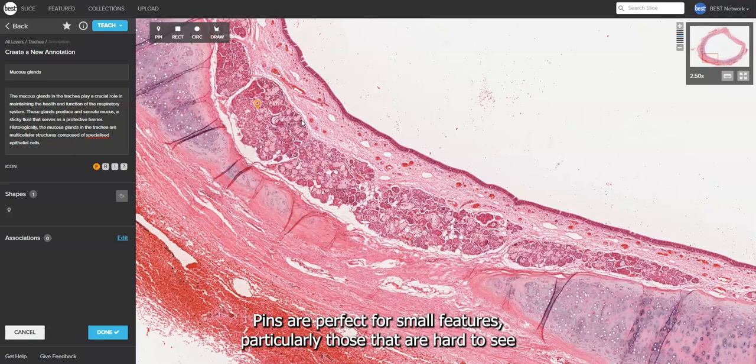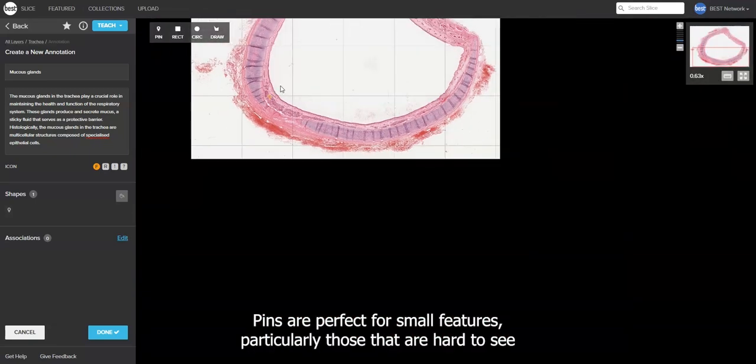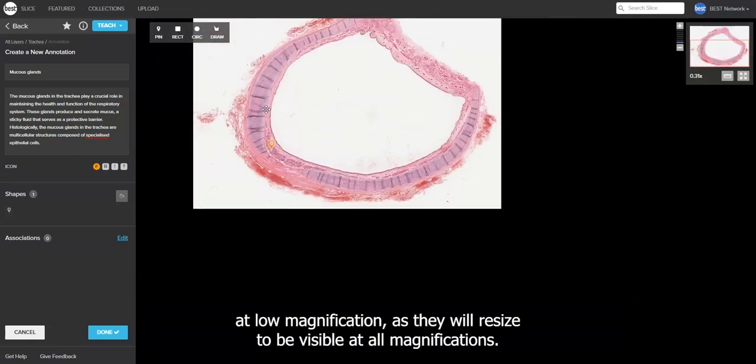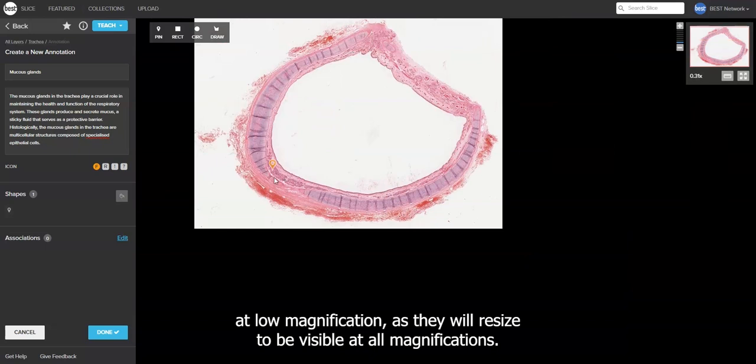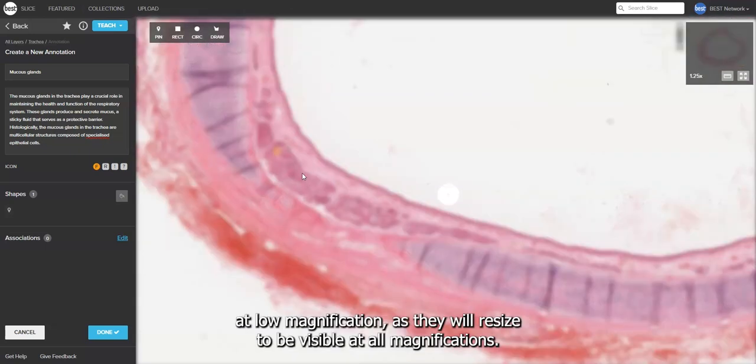Pins are perfect for small features, particularly those that are hard to see at low magnification, as they will resize to be visible at all magnifications.